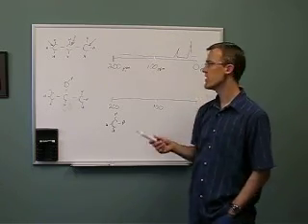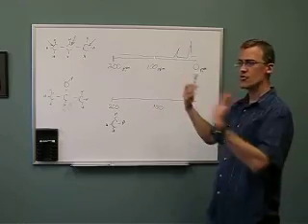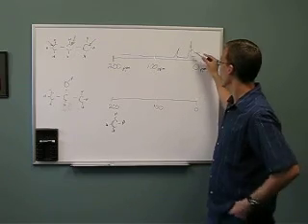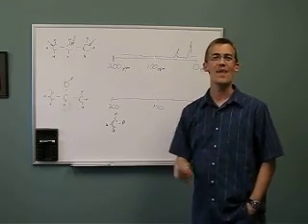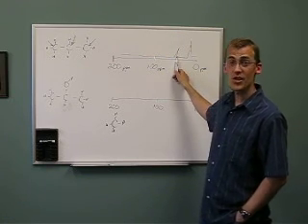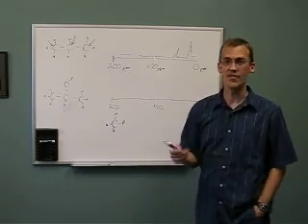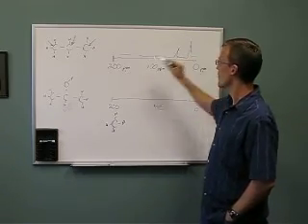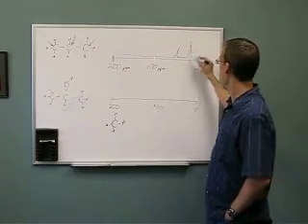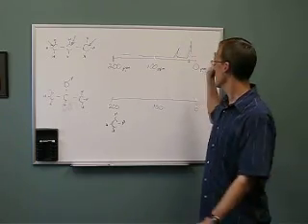So what does this make me think if I were to see this spectrum to begin with? Well, I've got some terminal carbons, and I've got some carbon that's in the middle, and the intensity tells me something about how many carbons. So this is twice as big as this carbon, so it's probably 2 terminal carbons attached to one in the middle. And it turns out that for this molecule or molecules like it, this type of carbon always shows up right here. It'll be somewhere around 10 parts per million or so, but it's always going to be there.